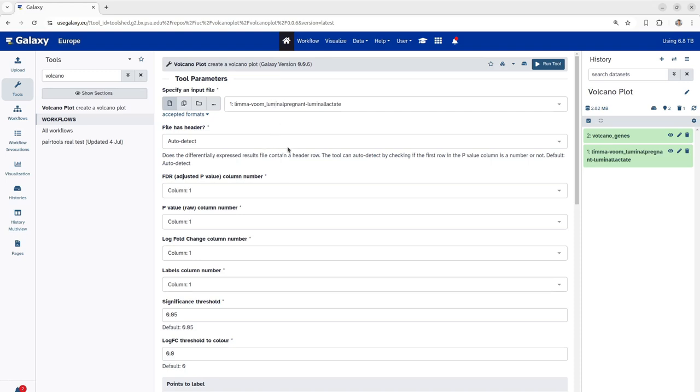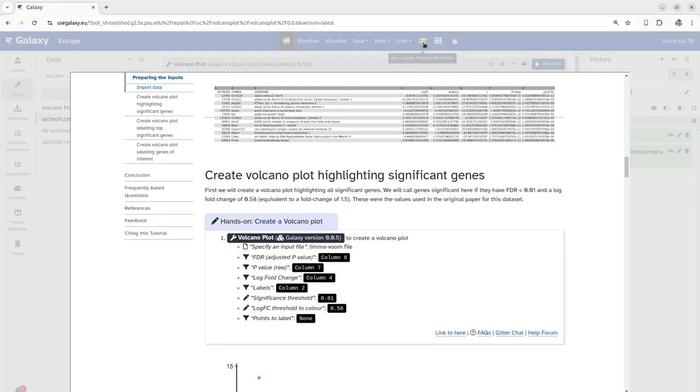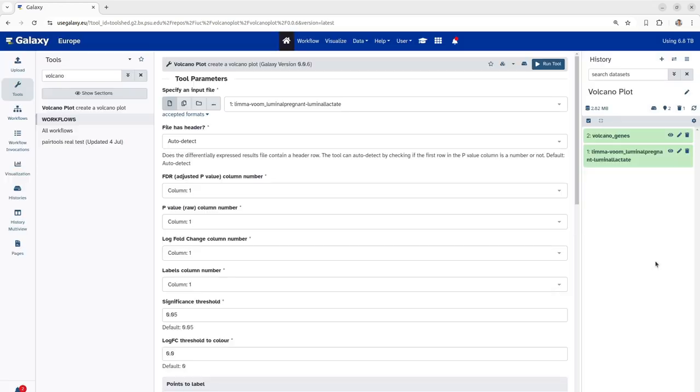Next, we have to assign the column names to their respective column labels. For example, the FDR column in this sheet corresponds to column 8, whereas p-value corresponds to column 7 and so on. So, we have to go on assigning these columns respectively to their column numbers.